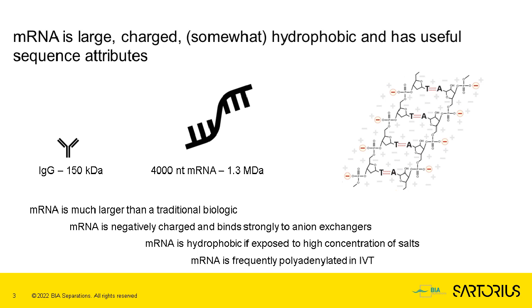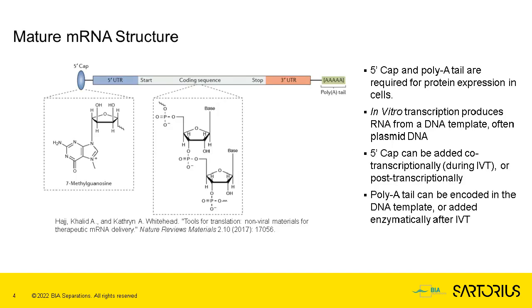So these are some of the key features that I'd like to take with us as we travel along the journey of producing and purifying mRNA. And then there are, of course, the more strictly biochemical critical quality attributes, if you wish, which relates to the mRNA sequence and capping properties.